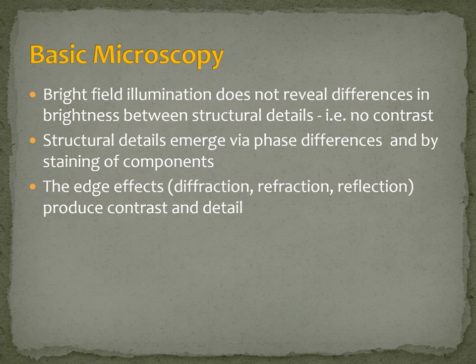So basically in this presentation what I've been telling you is how microscopes were developed in the beginning, but just the simple microscope. I didn't tell you about immunofluorescence or other techniques. We just talked about bright field microscopy, where you don't use any stains, we just illuminate the samples, and it's very difficult through bright field to obtain structural details, because usually the samples lack contrast.